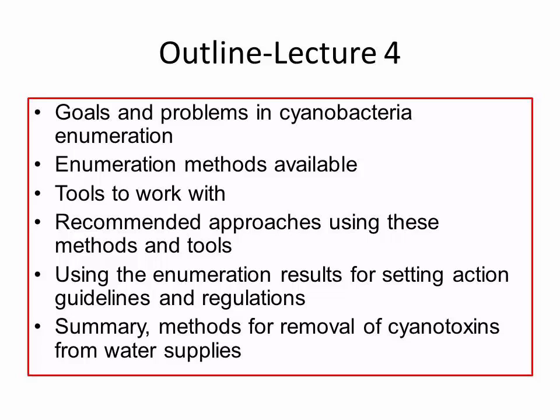the algae to identify today, cyanobacteria. So what I'm doing here is goals and problems for enumeration methods, tools, recommended approaches, and using those results for setting action levels. Whether it's a flow chart or whether it's how you get to a point where you say, okay, now we have to post this lake or put out some kind of an alert.